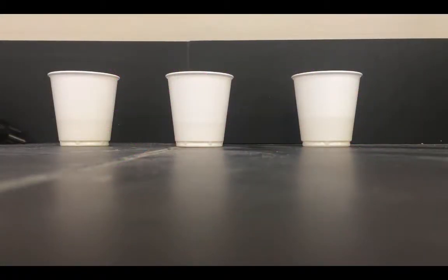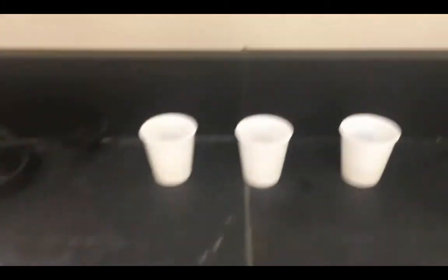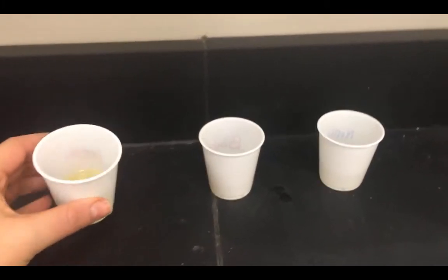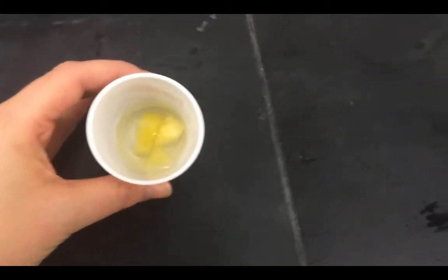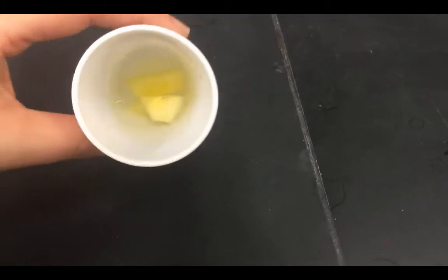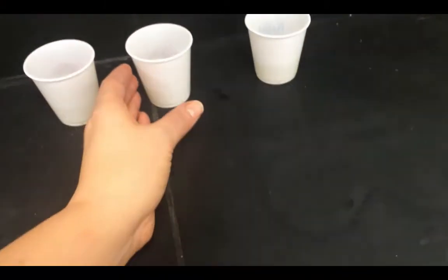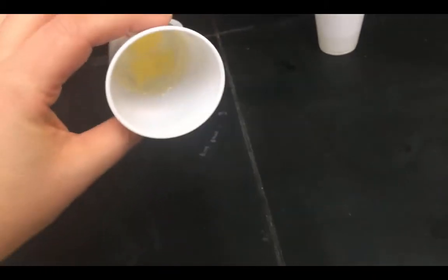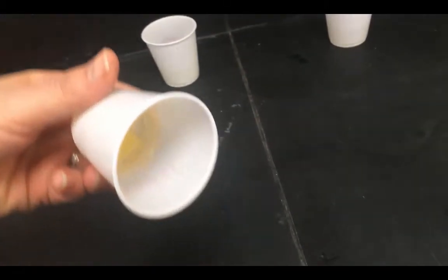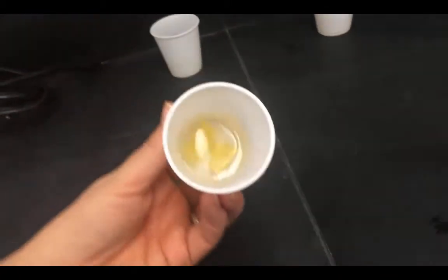So now 45 minutes or so later, we can take a peek at our results. Here is the fresh pineapple — look at that, very, very liquidy still in there. Now if I take the pineapple that had been boiled, look at that — the gelatin is completely solid. I can even tip it and see no gelatin comes out. It is totally solid.